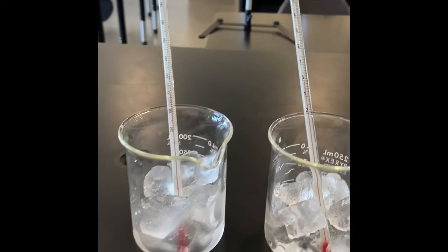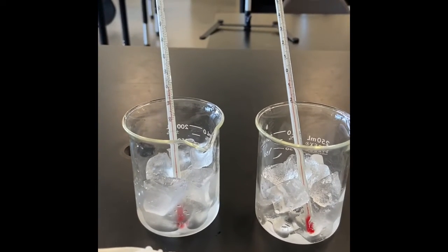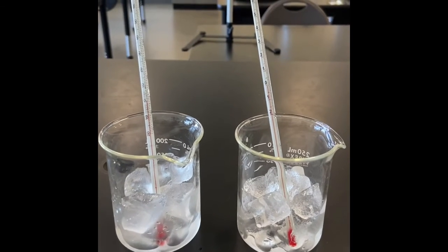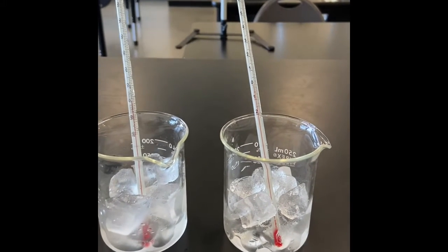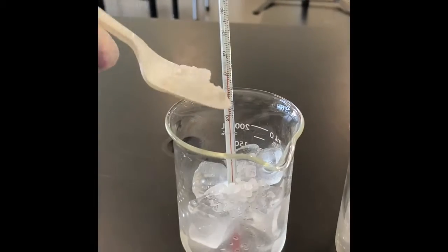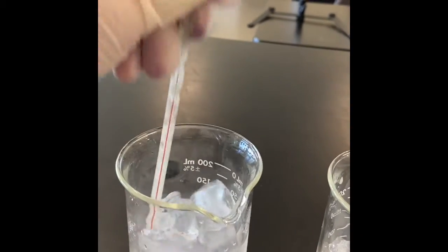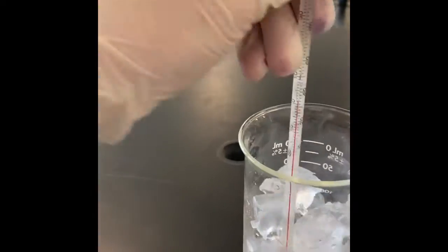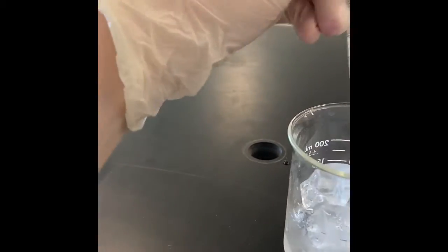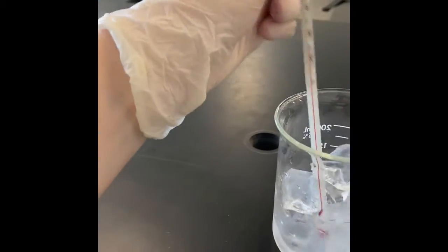Go ahead and pause the video and make a prediction. Do you think that a mixture of salt and ice will have an effect on this temperature or this freezing point? Write down or type what you think that effect will be. All right, I'm going to stir around the ice and salt until I know it's well mixed. And I'm going to leave it for a few minutes just to let the new temperature show up on the thermometer.